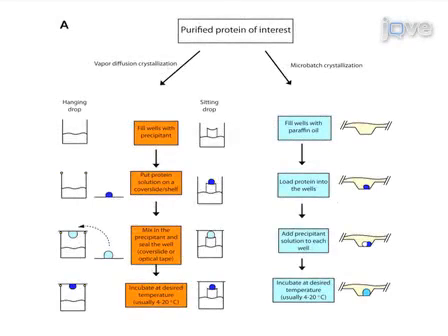The overall goal of this procedure is to produce protein crystals for x-ray diffraction experiments. Here three different techniques for crystal screening are demonstrated: vapor diffusion crystallization methods including hanging drop and sitting drop, as well as micro batch crystallization methods.